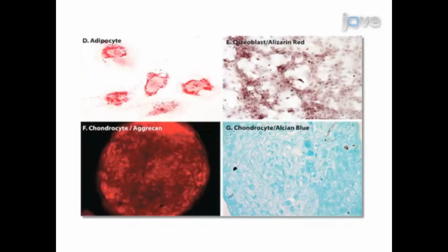For each cell preparation, evaluate the ability of lung MSC to differentiate into traditional mesenchymal lineages of osteoblast, adipocyte, and chondrocyte, and their cell surface expression of accepted mesenchymal markers. Perform cytogenetic banding analysis to confirm the absence of gross chromosomal abnormalities.